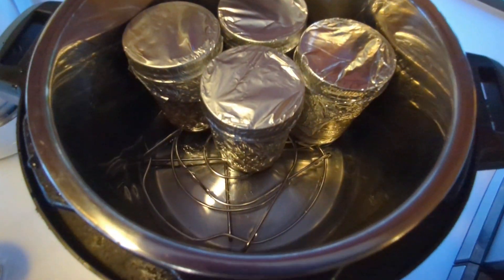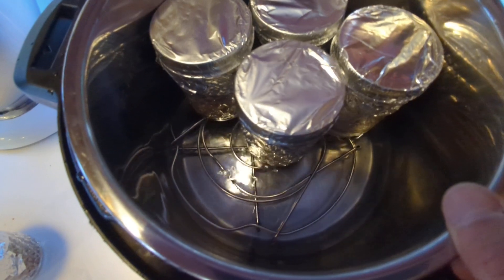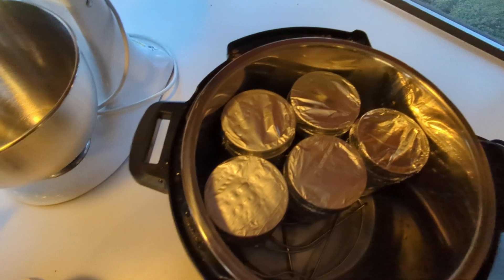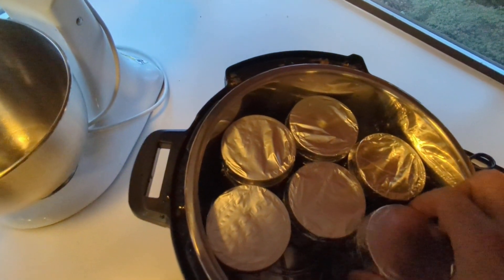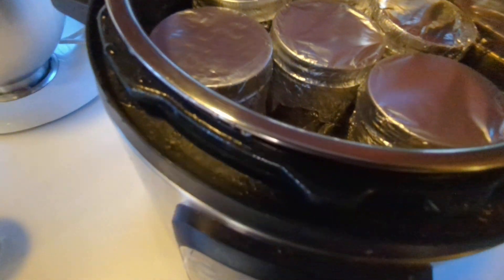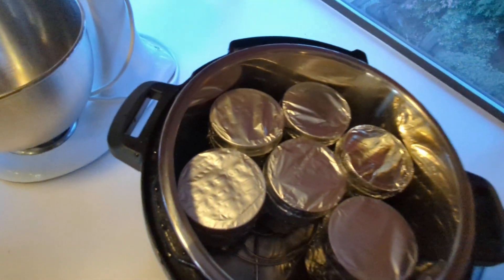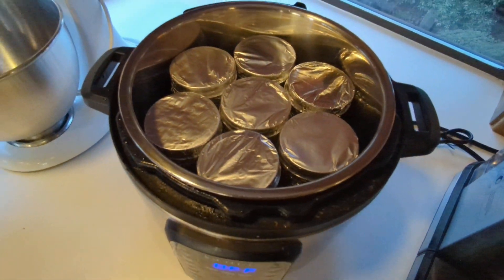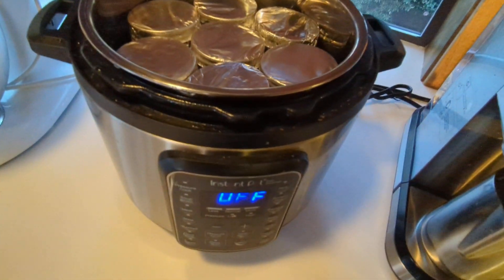Inside the instant pot itself, there's some water in the bottom that will be able to boil and steam. Since the instant pot really doesn't lose much water, we don't need a ton. I suppose if you really wanted to, you could fill it up over the bottoms of the jars, but that's not necessary. So they will fit seven half pints.